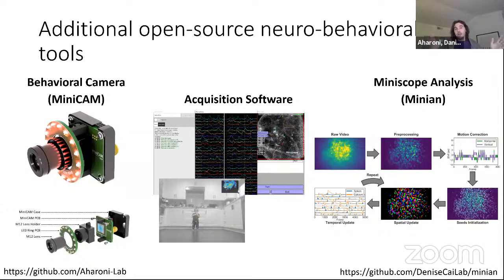There's a Jupyter notebook, and for every chunk of the process, you see the code with a big description of what the code's doing. And you can run the code using multiple parameters, and then it visually shows you the impact of those different parameters on your data and explains what you were looking for to optimize the data. But I think for the most part, they're all open source. They all are doing something similar. You can always convert your data into whatever format these pipelines take.